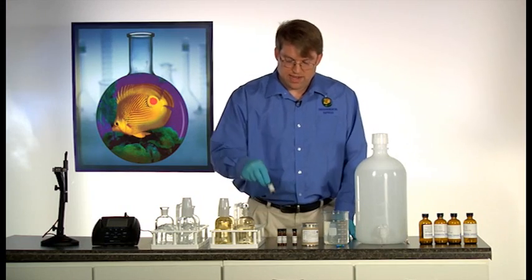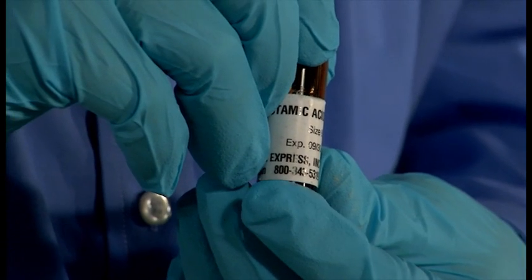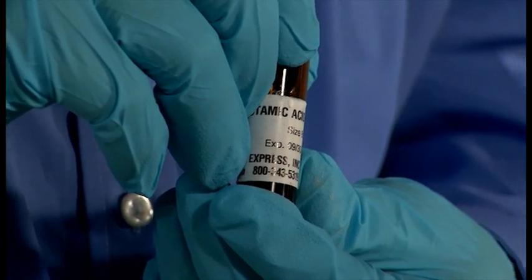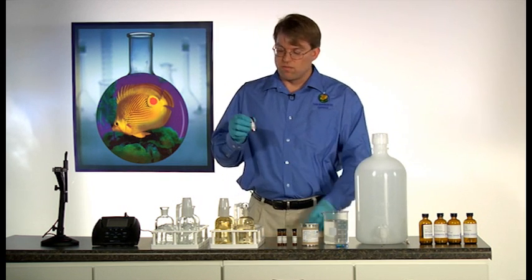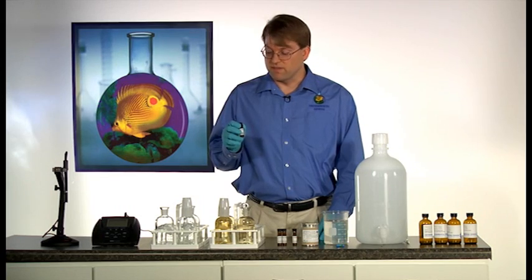The glucose and glutamic acid check standard is the primary measure for precision and accuracy of a BOD batch. For ease of use, prepared vials with the appropriate amount of glucose and glutamic acid are recommended.